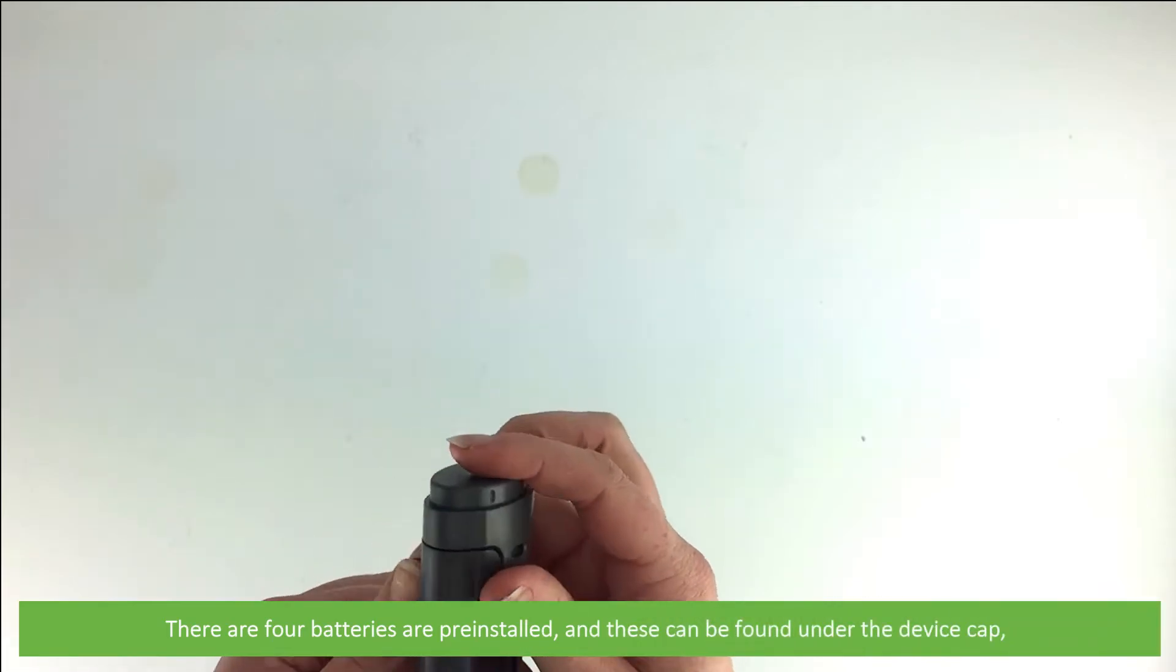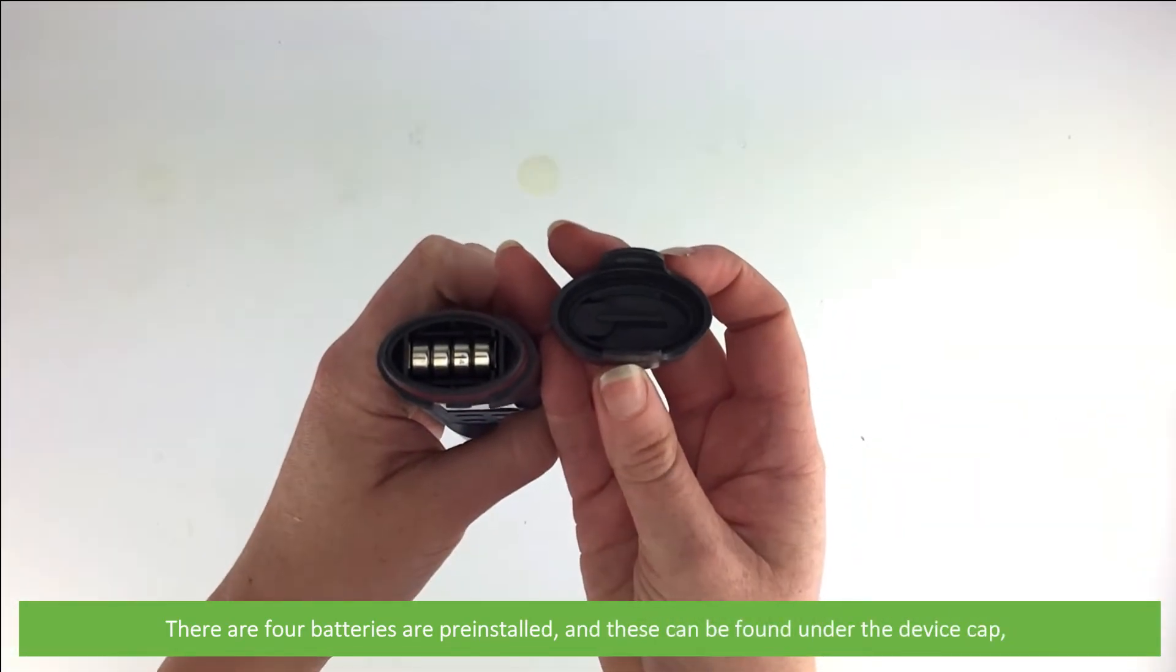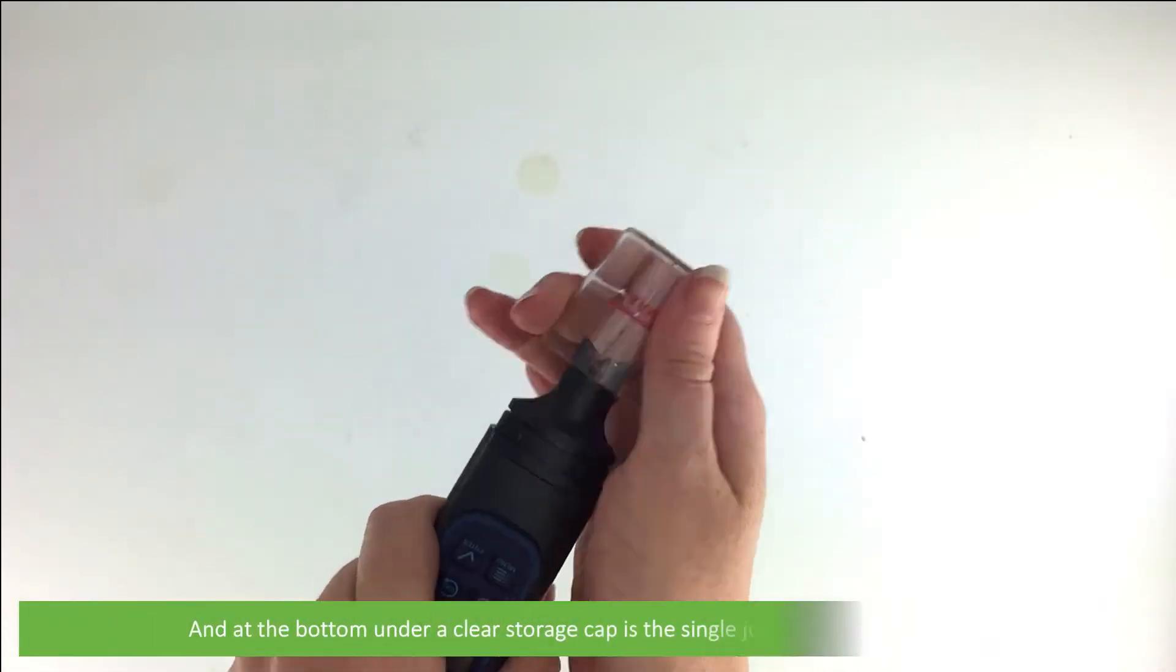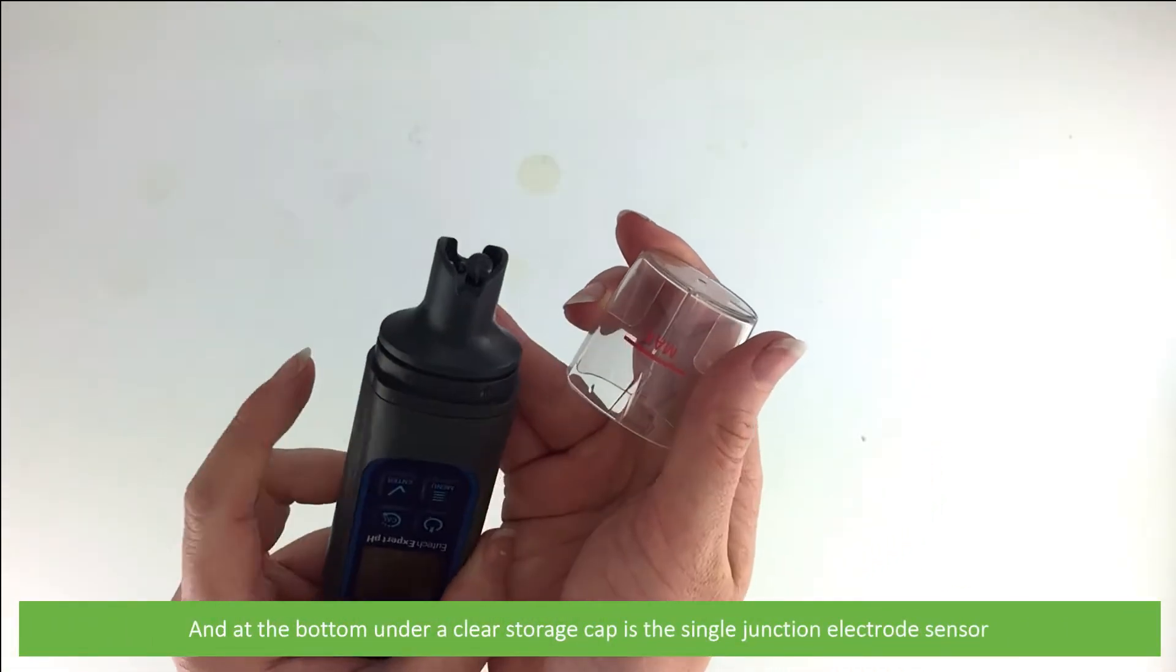There are four batteries pre-installed and these can be found under the device cap. Then at the bottom under a clear storage cap is a single junction electrode sensor.